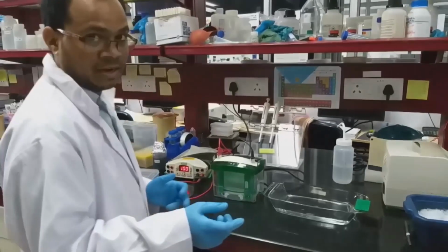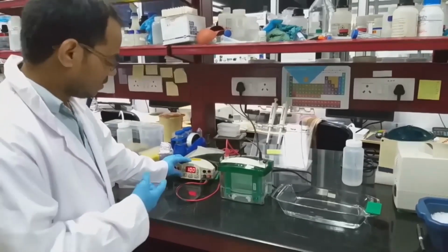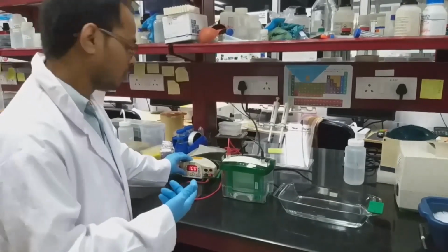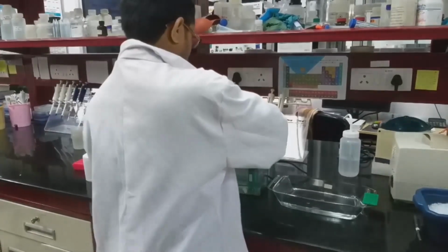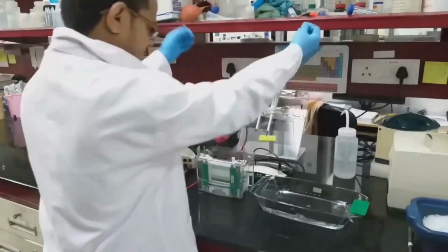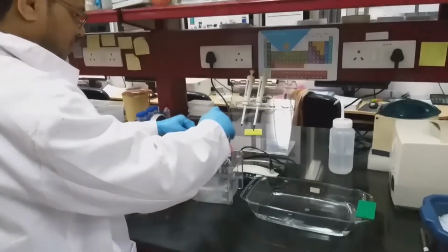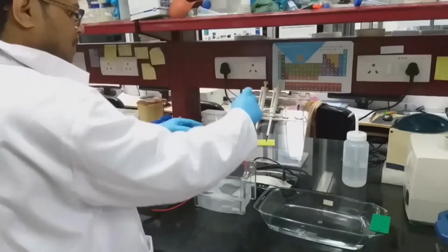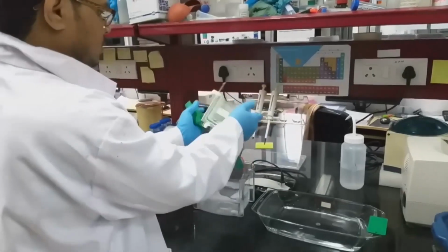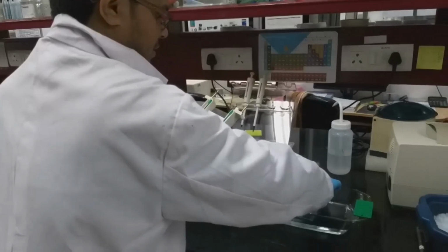So I am going to start the gel run, then I will remove it and show you how to remove the gel. Take out the glass plates.